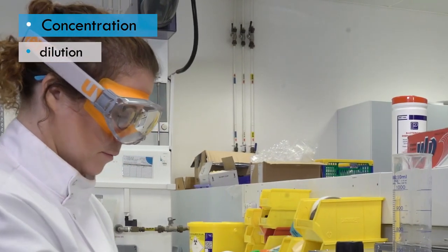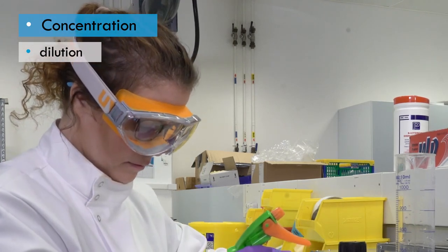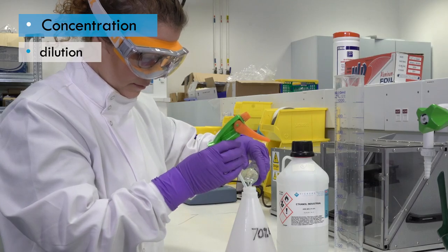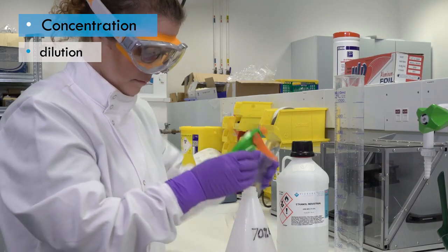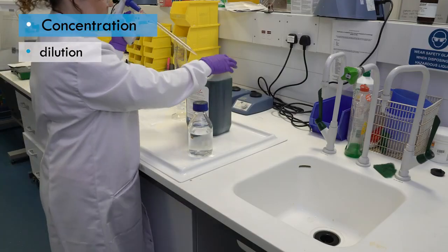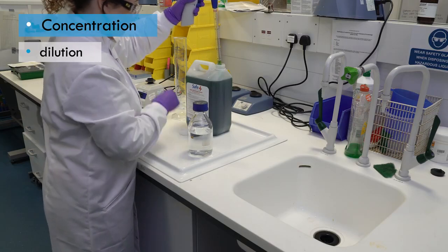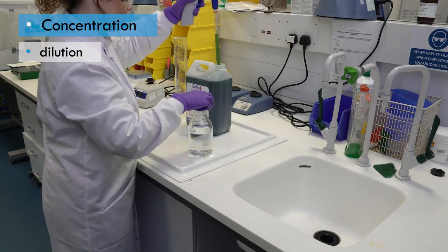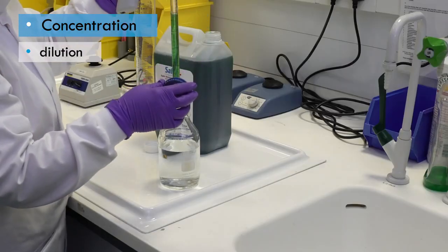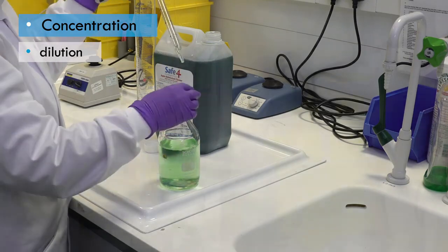Remember, most disinfectants will cause harm if they contact the skin, and they may also give off harmful fumes. Personal protective equipment should be worn, for example, a lab coat, gloves, and eye protection. Disinfectants should be handled in a well-ventilated area or a biological safety cabinet, especially when handling the concentrated form. It's advisable to put the equipment on a tray to contain any splashes and spills.